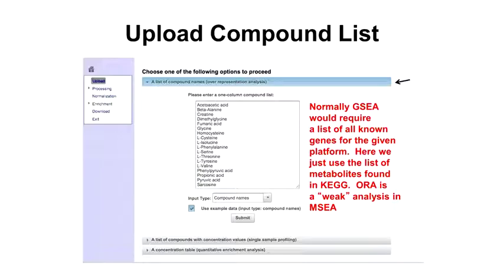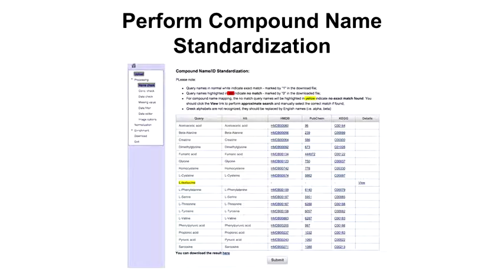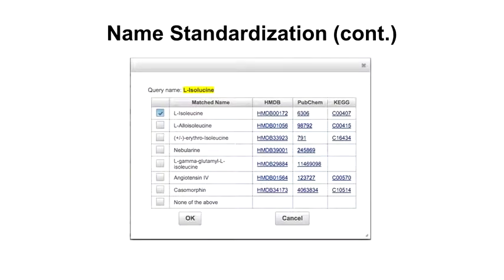When working with names, it's really important to make sure everything is named properly. In some cases, people have typographical errors — here there's an example where isoleucine was misspelled. When it did its name normalization, looking to see if it could find a compound with that name, it couldn't find anything in HMDB, PubChem, or KEGG. It says either you've made up a new compound or you've mistyped something. You can edit it, change the name so it's properly spelled — from 'isoleucine' without an E to 'isoleucine' with an E — and it suggests alternatives so you can click on the correct metabolite.